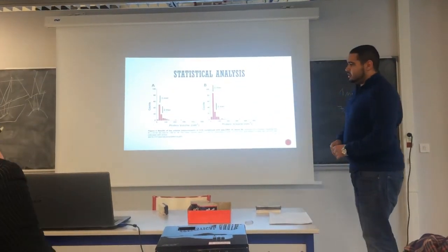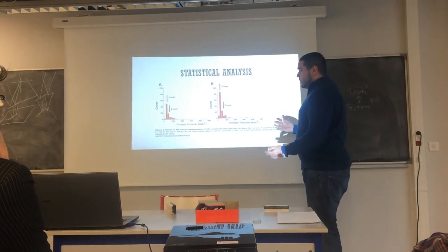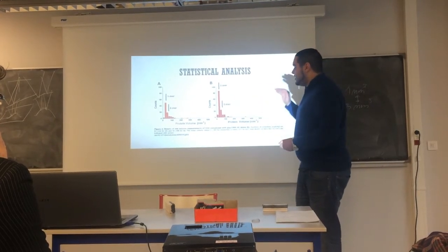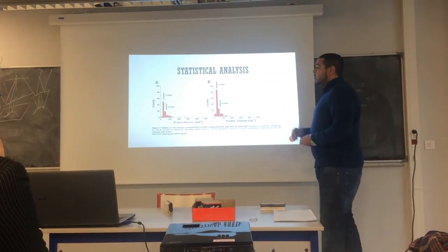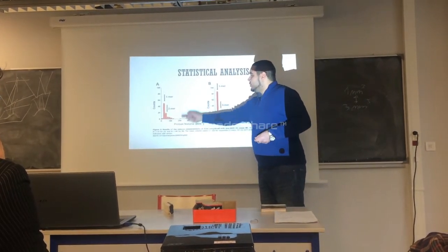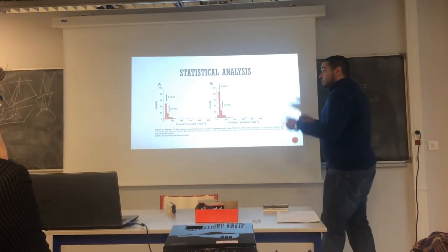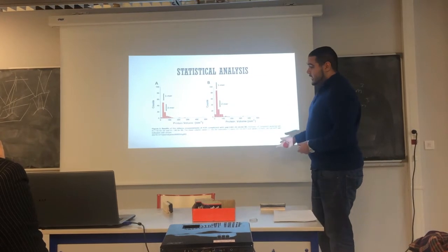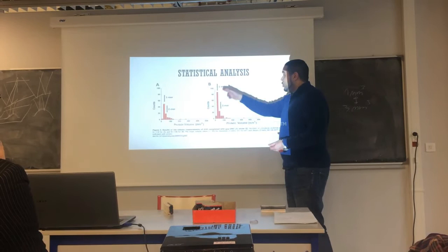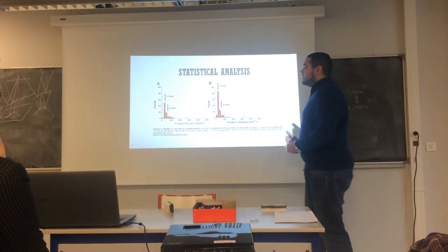So they did a statistical analysis, and they came up with these histograms. The histograms are very self-explanatory. When they did the imaging with free A3A, which means A3A alone in the solution, they found that A3A had more tendency to exist in a monomeric state, which is seen here, obviously. And then they did the same procedure with A3A in presence of DNA. Then again, we see that the protein prefers to be in a monomeric state, which means it retains its monomeric state after it binds itself to the DNA.